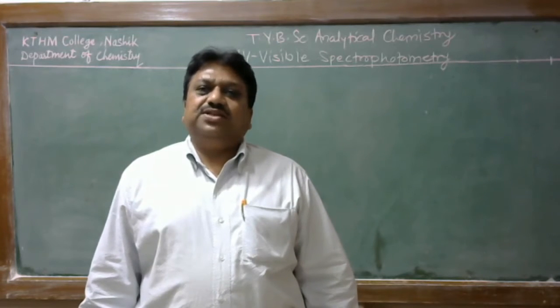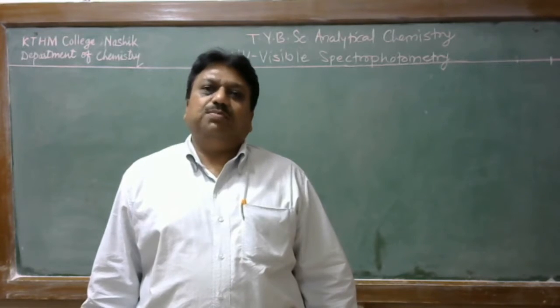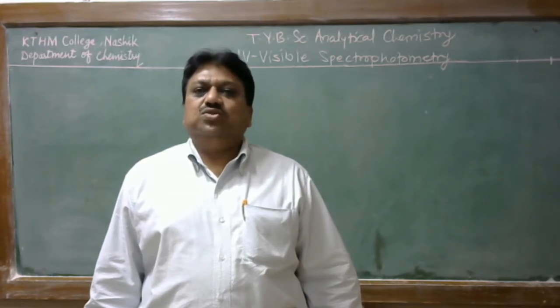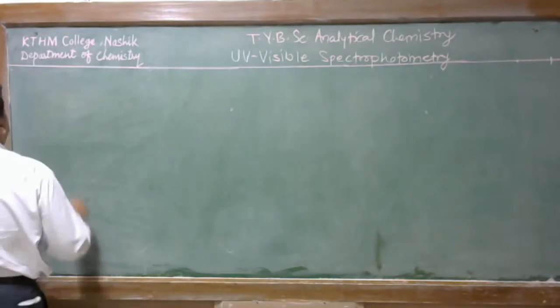Student, in the previous lecture we discussed the laws of photometric analysis and we solved problems based on those laws. In today's lecture, we discuss the instrumentation of spectrophotometry, that is, the instrumentation of spectroscopy.